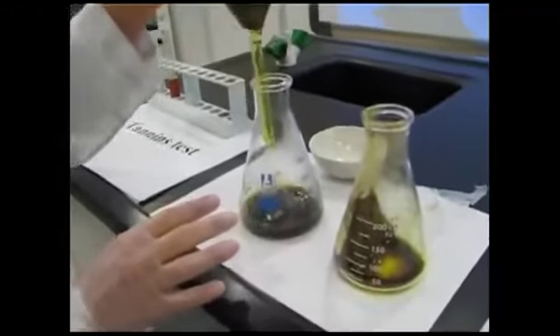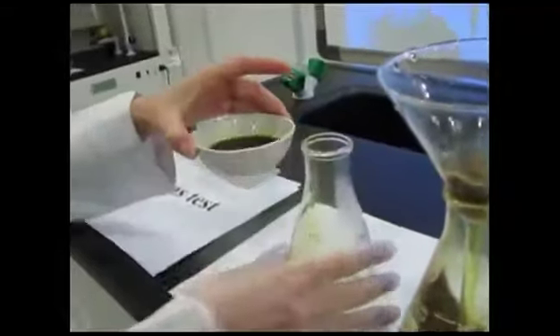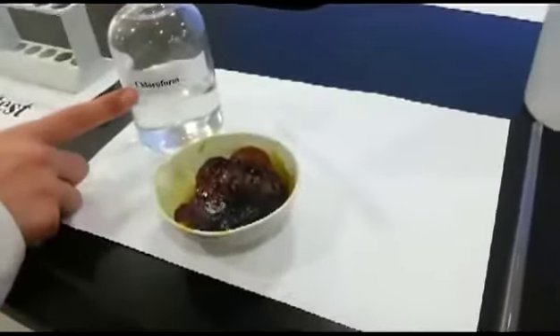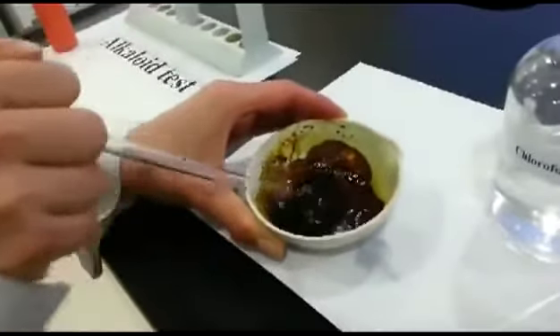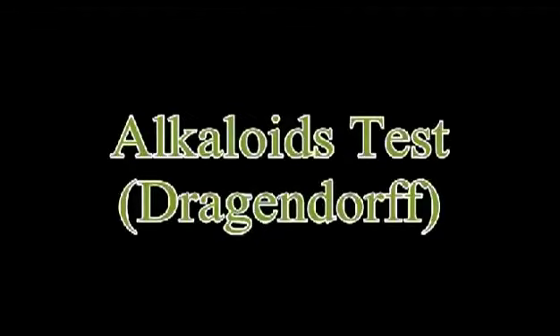Then this alcoholic extract is shifted into the porcelain dish, and that will be heated until all the liquid evaporates. After the evaporation process, we are getting this dried material. To this dried material we are adding 6 milliliter of chloroform and dissolving all the dried matter in it. And we will now be performing different tests for sterols, triterpenes, anthraquinones, and anthraquinone glycosides.